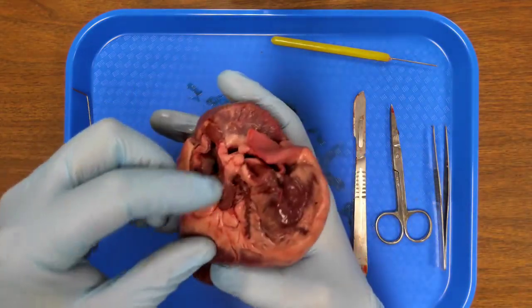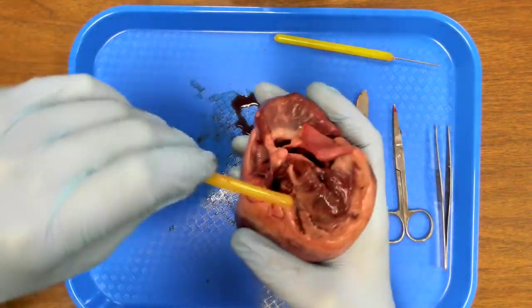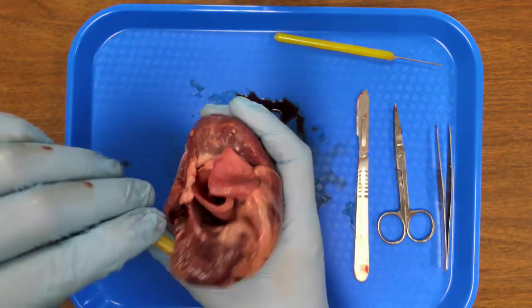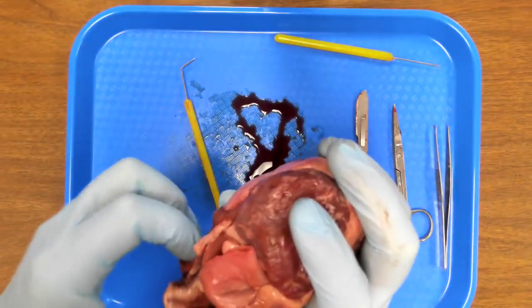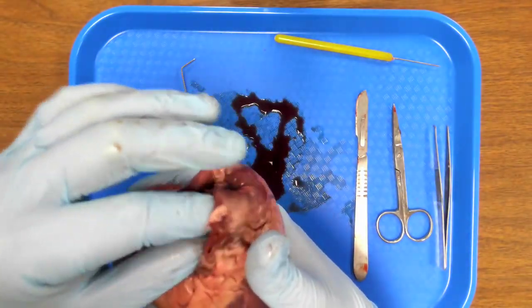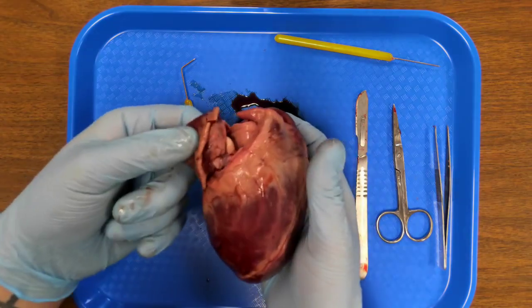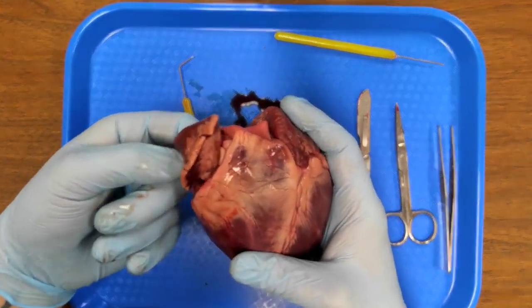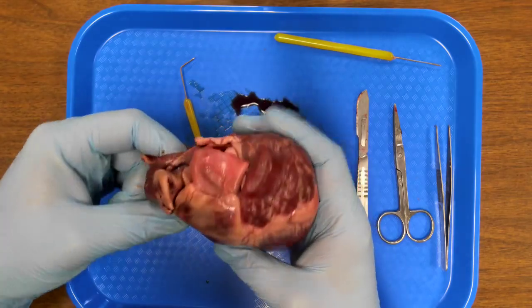Now, if I'm looking at this, I can start to probe my way into certain areas. I don't want to poke myself, but right here we have got our vena cava, which leads into the right atrium, which is the top chamber of the heart. Notice how small it is compared to the ventricle here.